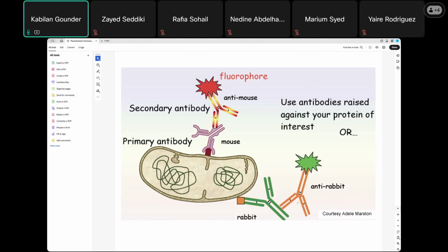But for sections, to study how cellular proteins or other components are expressed in the cells, you have to process: fixation, dehydration, infiltration, embedding, sectioning, right? So during the staining process, you have to choose whether to go for regular or fluorescence.